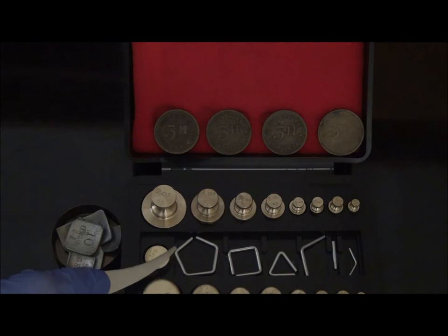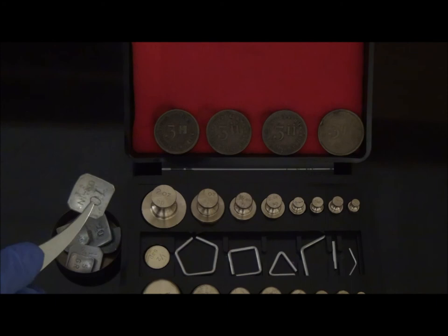In contrast, aluminum wire weights do not have this problem and are considered the best grain weights. Another advantage of wire weights is that they are shaped differently from typical cylindrical weights and are therefore easily distinguished from other weight forms, preventing mix-ups. The weight in grains is identified by the number of sides the wire has. For example, this aluminum wire represents five grains because there are five sides. Likewise, a triangular wire represents one grain, and the bent wire on the far right represents a half grain. Flat aluminum grain weights are also less corrosive — they are cut out of aluminum plates, their corners are clipped, and then pressed into a curve allowing for easier handling with forceps.